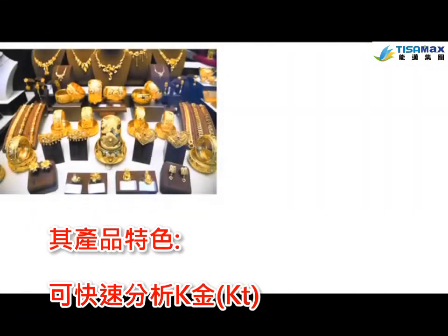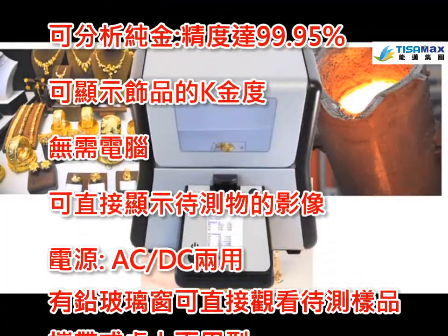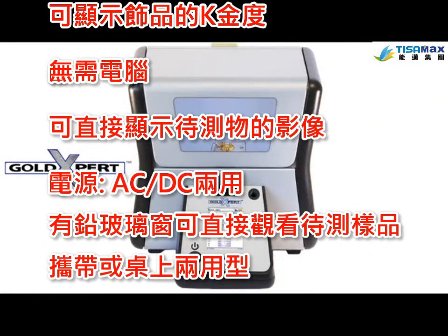Whether you are a jewelry shop owner, a refiner, or a pawn broker, the Gold Expert will give you accurate results in just seconds. It's the ideal solution for your testing needs.